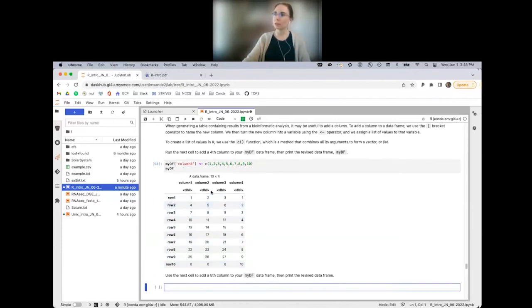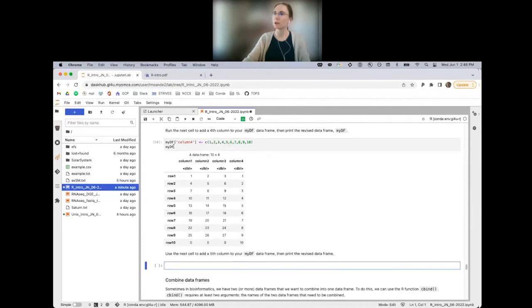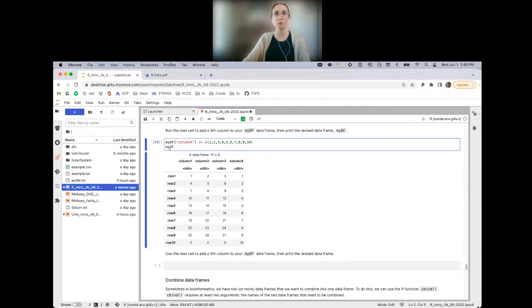I think this might also be the first time that I have 2 lines of code in one cell. In case it was not clear before, a cell in a Jupyter Notebook can accommodate more than 1 line of code as long as they are on different lines.